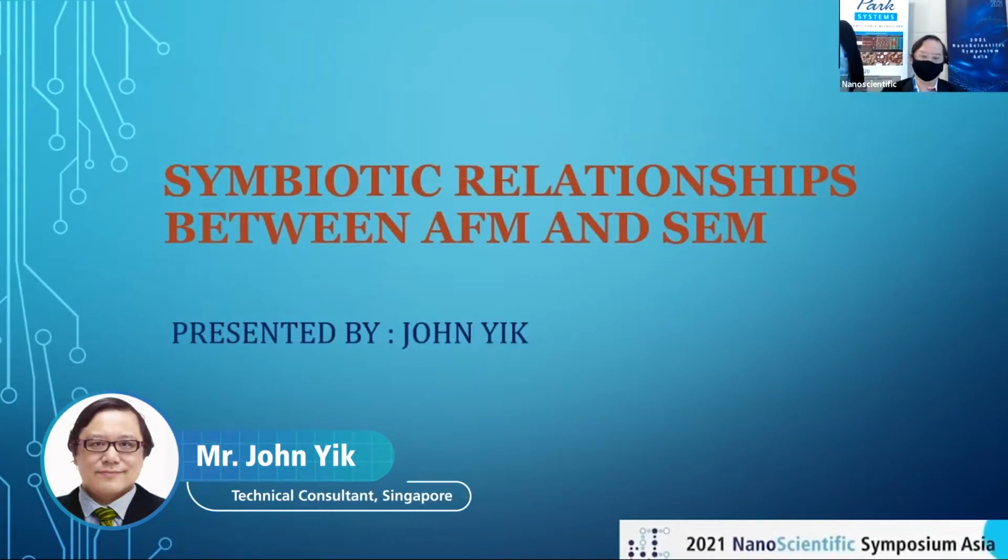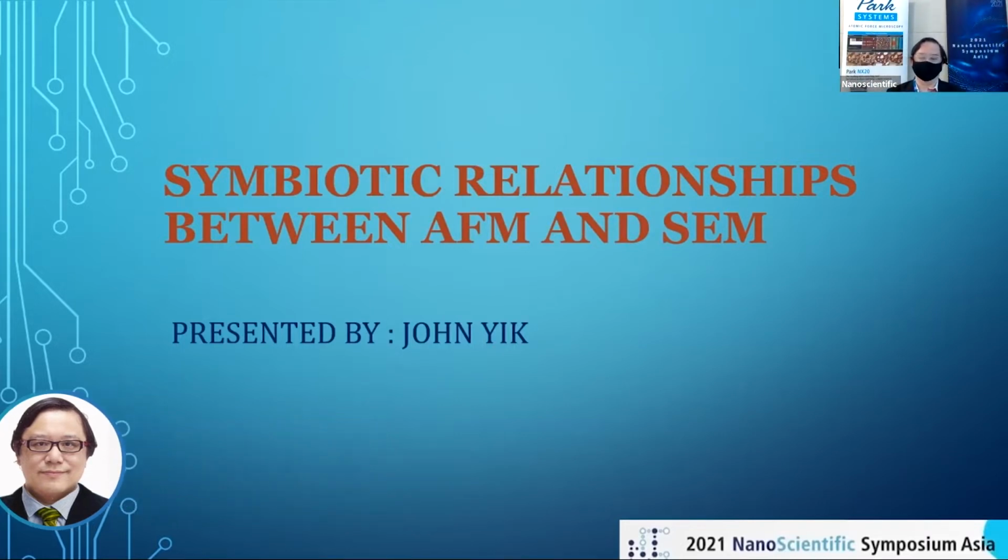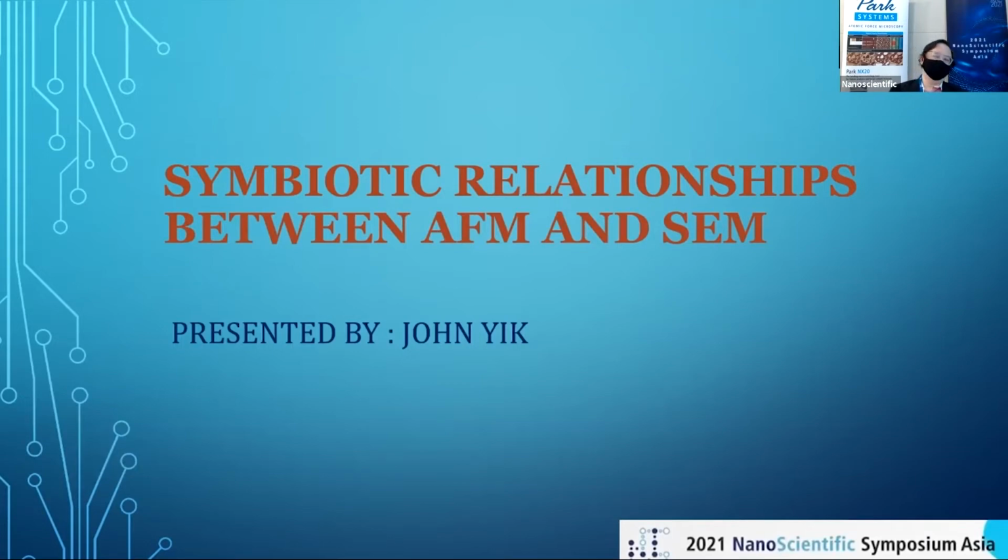My name is John. My presentation today encompasses the symbiotic relationship between the AFM and the SEM. These are both very common technologies that we find in the industry today. Generically, my focus today is more on the application of these tools in the semiconductor line.